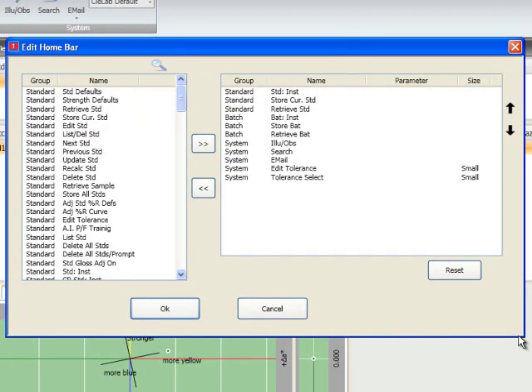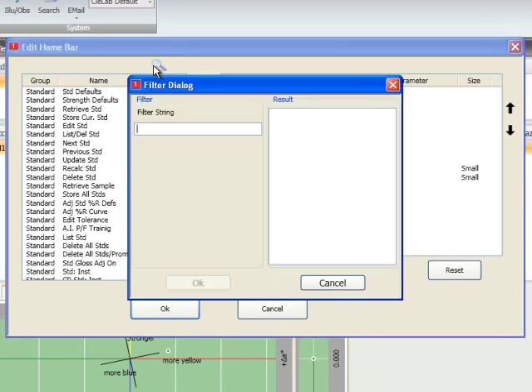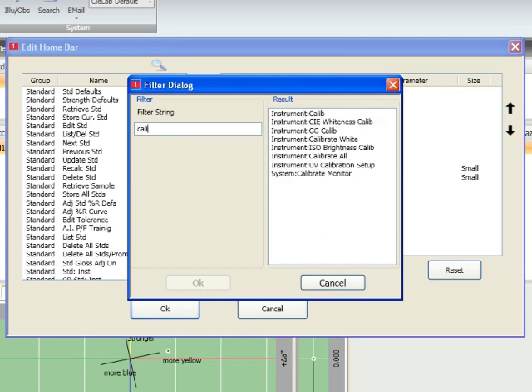If we would like to add the ability to calibrate the instrument, we can click on the magnifying glass, type in the word Calib, then select the appropriate option, Instrument Calib.